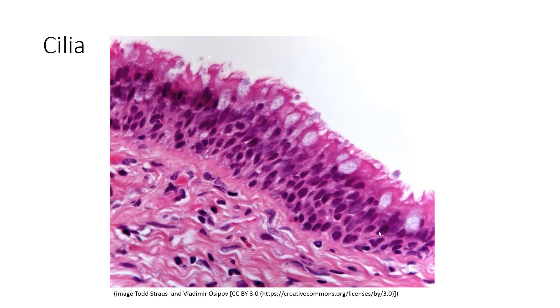The first is cilia. Cilia are these hair-like extensions that we see here on the apical surface of the cell. Just to orient you, this is the basal surface here, and this is the apical surface here. These little hair-like extensions coming off the apical surface of the cells — these are the cilia.